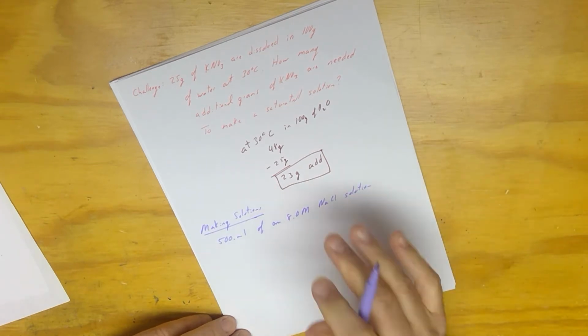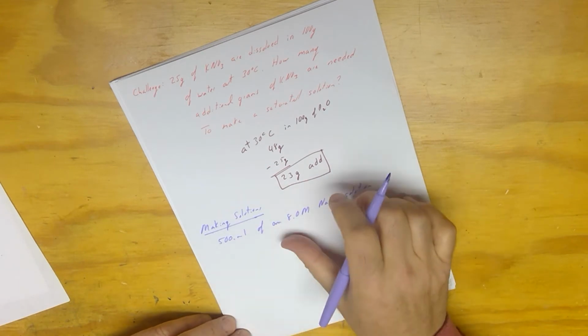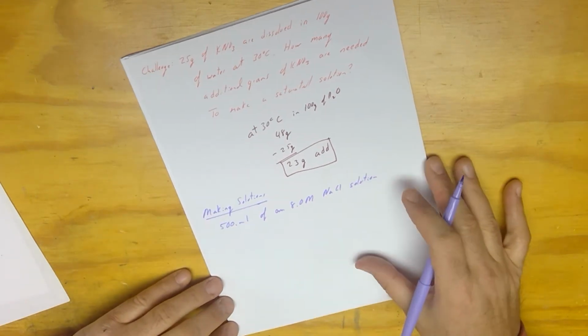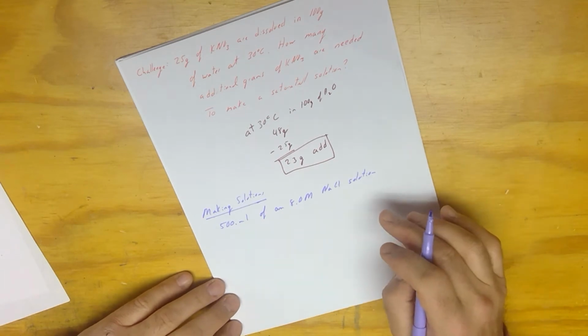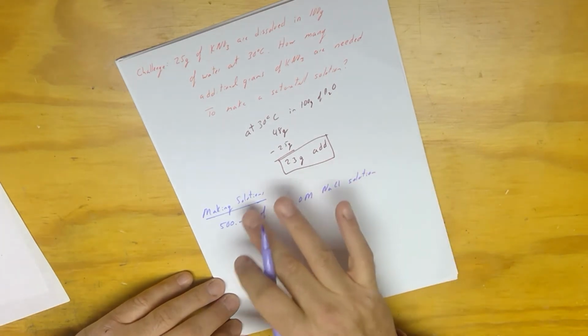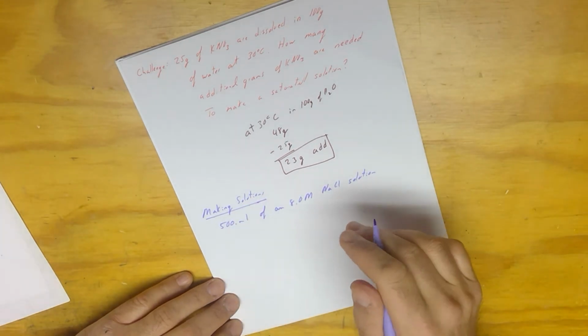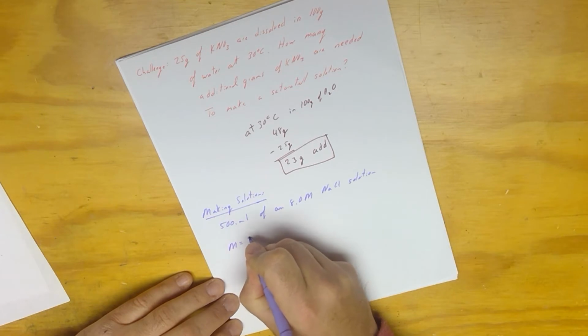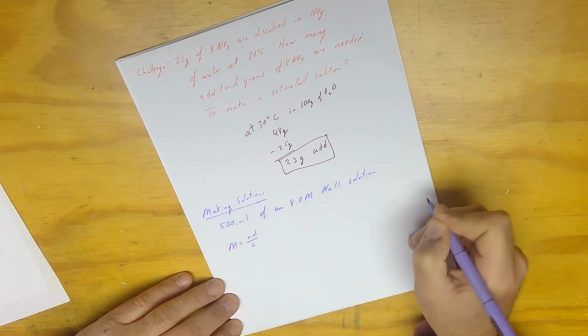Okay, let's say that that's what I need for a lab. So I have to make this solution. Well, before I even make anything, I actually have to do math. I've got to figure out how much salt I need to put in my water. So I start with the molarity equation: molarity equals moles over liters.